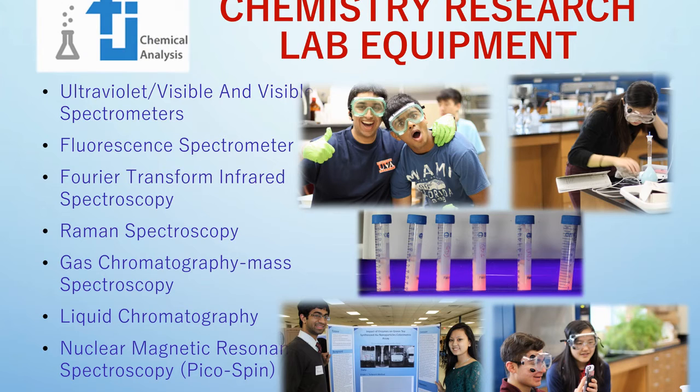As I pointed out in the lab video, we do have a variety of equipment in the chemistry research lab. Most of that is used by students in their research projects. Oftentimes students come back and comment on how the lab is better equipped than a lot of the small college labs they've been to outside of TJ. Overall, we probably have about $500,000 of advanced chemical instrumentation. Most of this is available for students in the research lab, but we will learn about the instruments within the organic chemistry elective class.